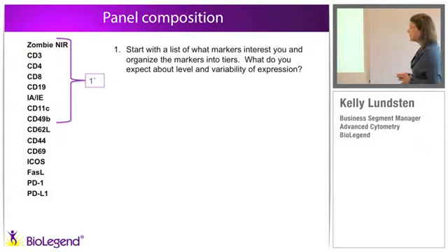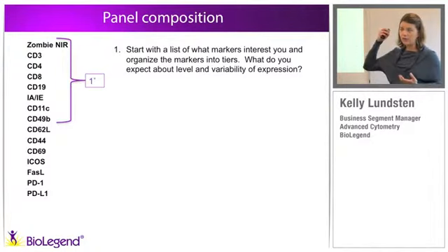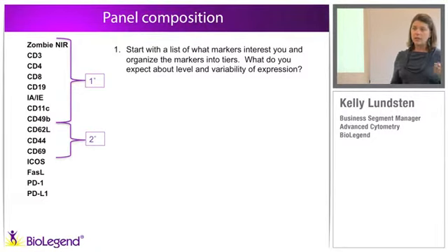And it doesn't mean that they're always extremely abundant, but they are molecules that I can get to resolve into a resolvable population, versus expression markers or activation markers where your range of expression is very variable, and those we call dynamic range expressors. So that's what you would consider to be your secondary tier, are these molecules where you're not going to get that population to just pop off of your negative. It's going to be something you're going to have to work at being able to resolve well.